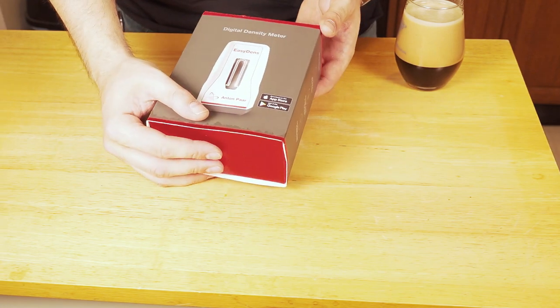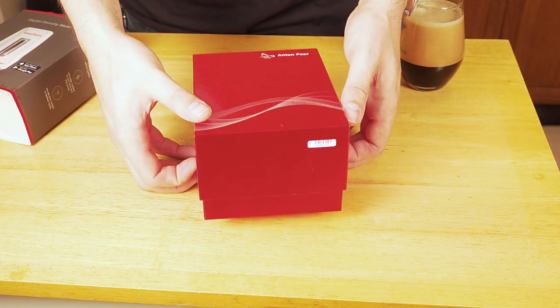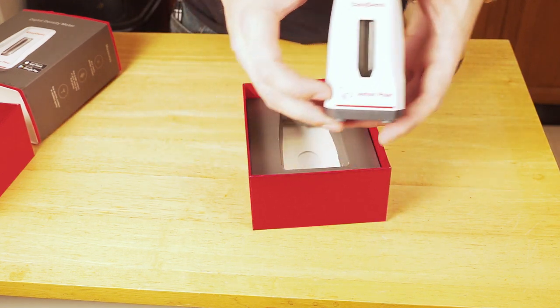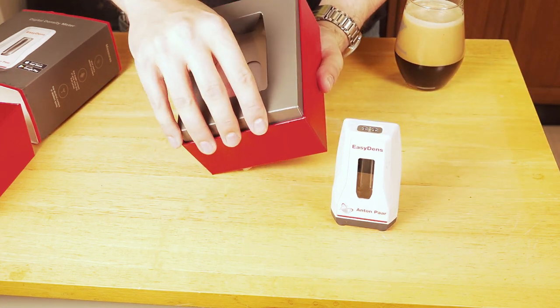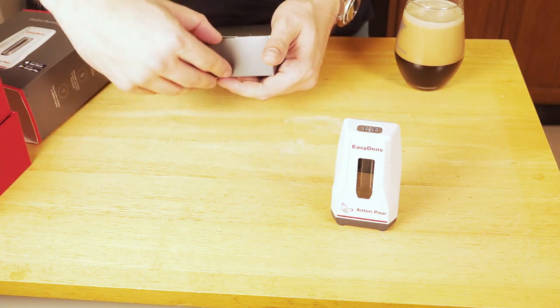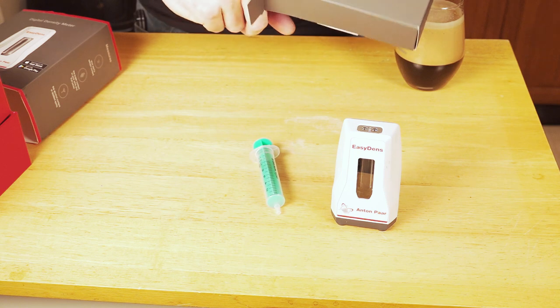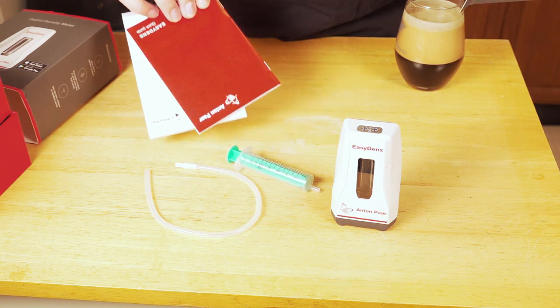The device comes in a really nice box. It has multiple parts. Here is the actual footprint of the meter — it's super tiny and really nice and easy to just store away in a corner. And then also in here you have all the rest of the components, which are actually very nicely packaged. The syringe is included, and the tubing is included. There's also a booklet with instructions if you need those.